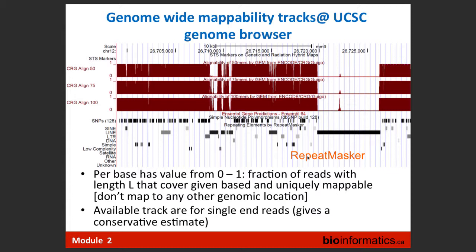The second situation is when we're comparing several data sets of slightly different conditions. Although I was telling you that mappability does not depend significantly on the read length, it's only true after we pass 50 bases. If we go to 30 bases, then mappability starts decreasing almost exponentially. So for 30 base pair reads, we have 20% of the genome not mappable. So when I'm comparing a library with 30 base read lengths to a library with 75, I will be discovering differences just due to differences in mappability between these two libraries. I have alignment in one library and non-alignment in another one.